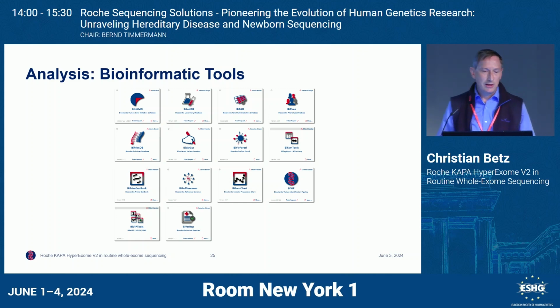Our bioinformatics team has, of course, implemented some nice tools for us, so we can analyze the data from the exome nicely. We have our own internal frequency database. We have this QC database. We have a panel database where we can update the content on a daily basis if needed.